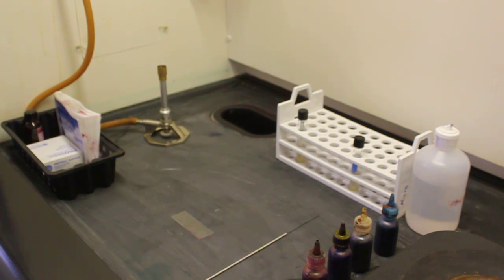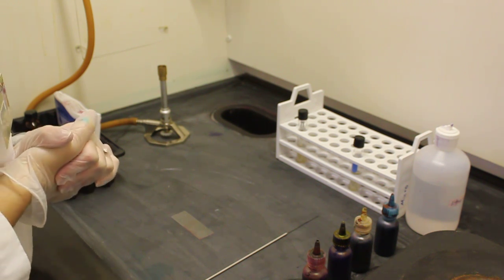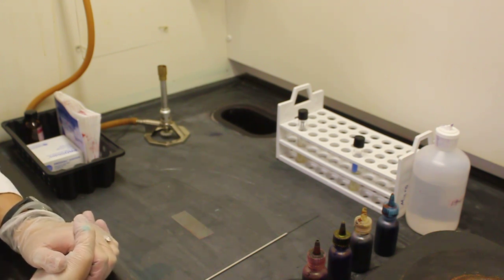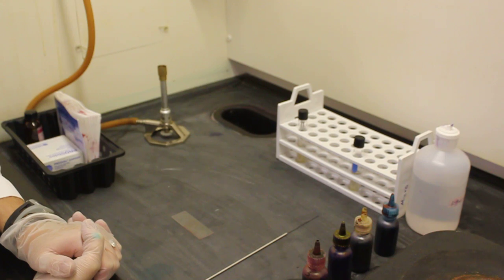I am now going to demonstrate how to do a gram stain. The gram stain is a differential stain. A differential stain requires the use of multiple dyes. At the end of this particular differential stain we will be able to differentiate between a gram positive and a gram negative bacteria.